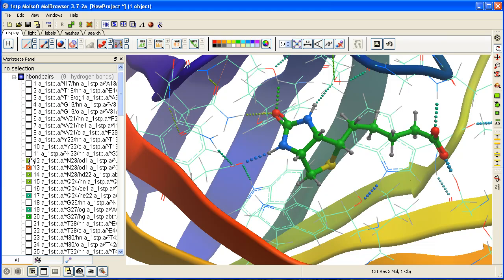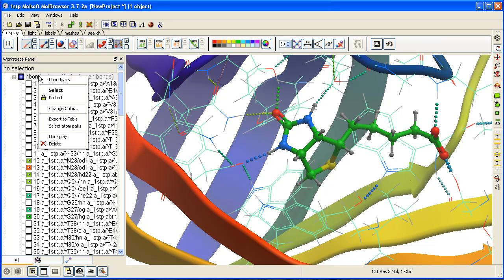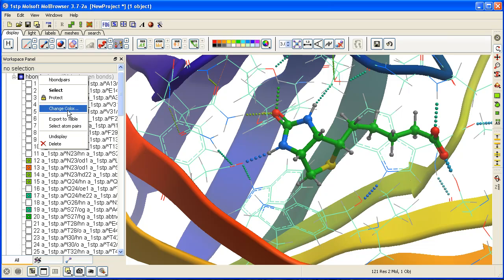You can also select atom pairs, export the list of hydrogen bond interactions to a table, and change colors of the hydrogen bond representation.